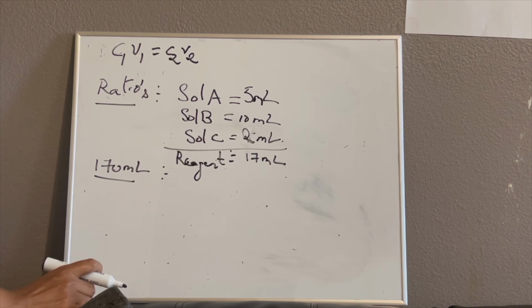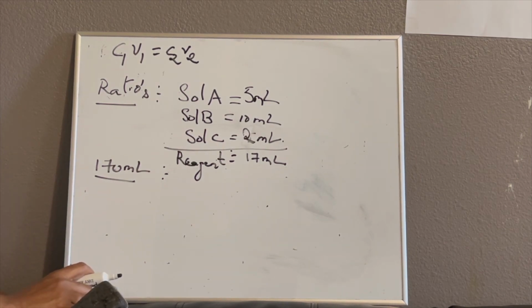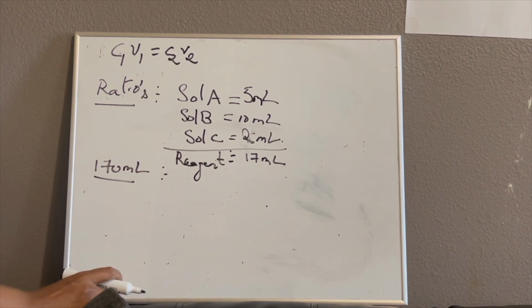And some of the reagents are photosensitive. In my lab I used detection reagents which are photosensitive, so we used to wrap them with aluminum foil, or in some labs they keep them in a dark place. Anything works. Whatever is your lab practice, we can follow that.